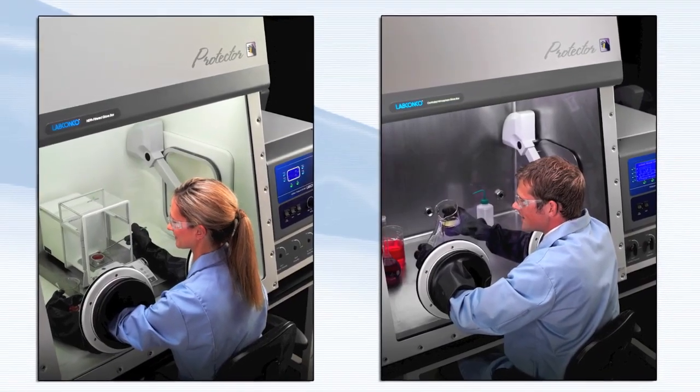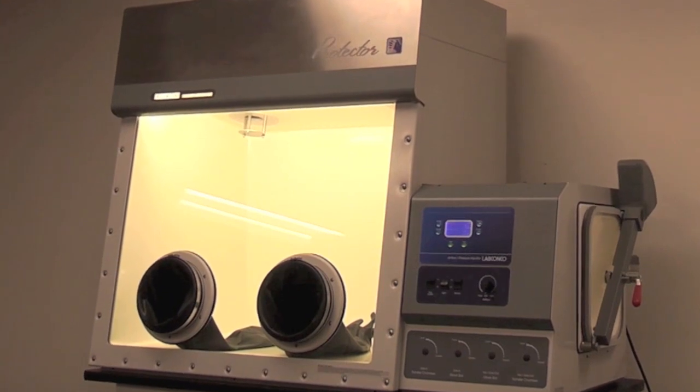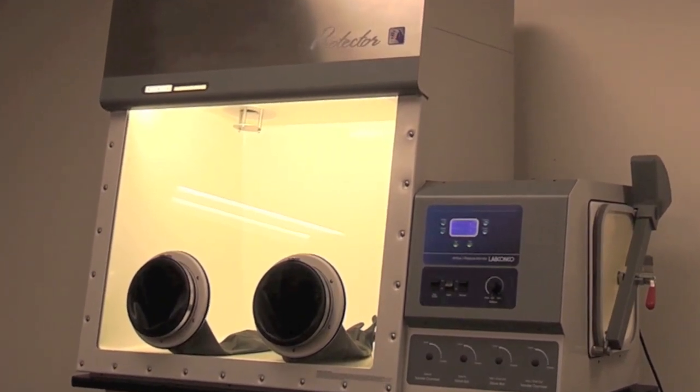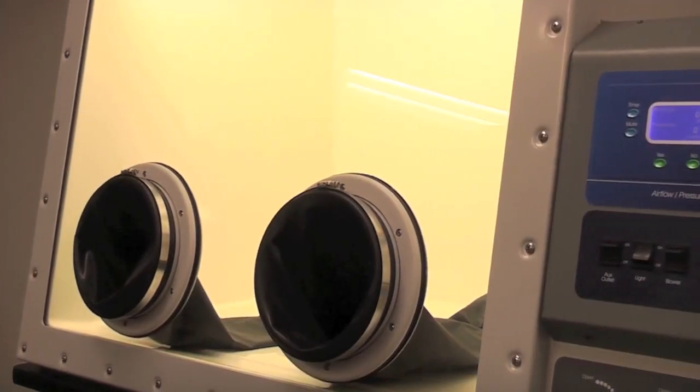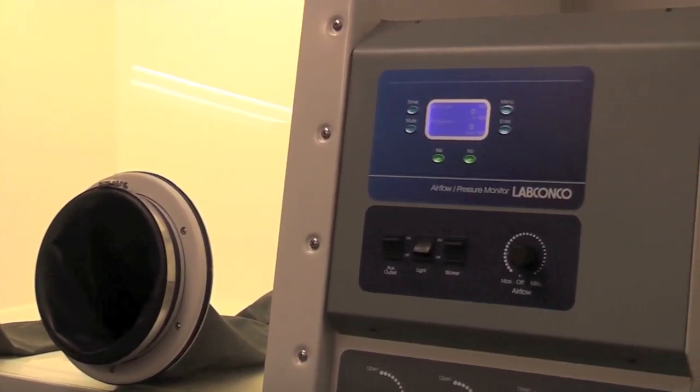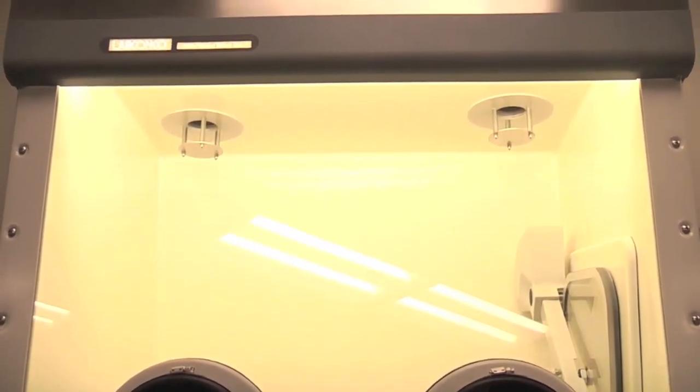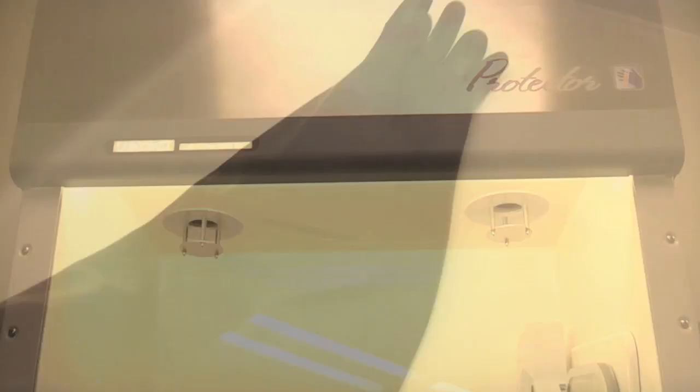LabConco's protector HEPA and ULPA-filtered glove boxes offer advanced operation features for containment and isolation systems. They provide leak-tight physical barriers protecting laboratory technicians during the manipulation of hazardous or highly potent compounds, providing maximum containment and an ISO Class 5 or better environment.